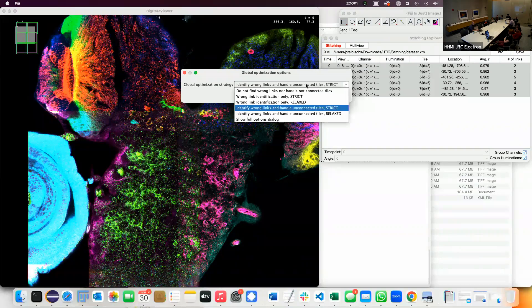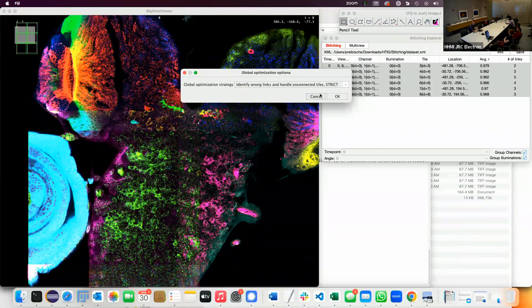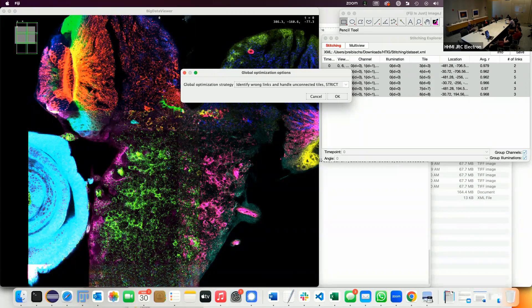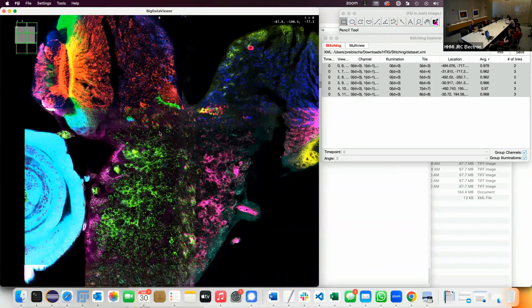Clicking OK is fine — it will try to find if certain links differ too much from others and kick them out. It will also handle unconnected tiles. For example, you take a mouse brain and all the corners have nothing in them — it will keep them more or less in the right place. Then it runs and we're done.